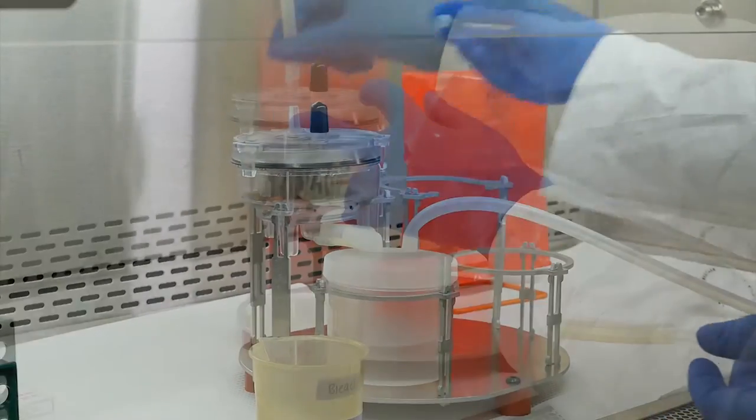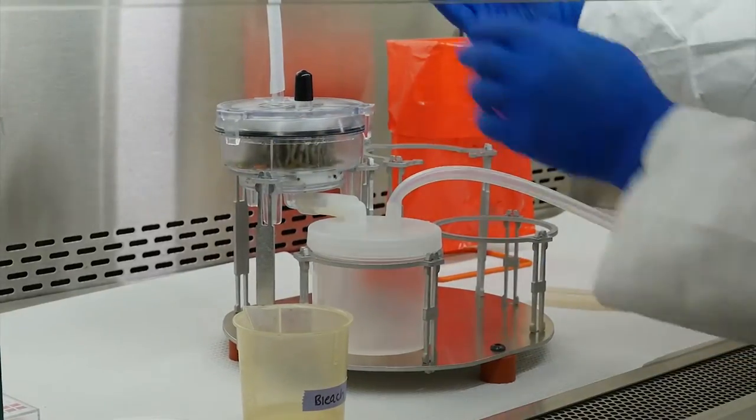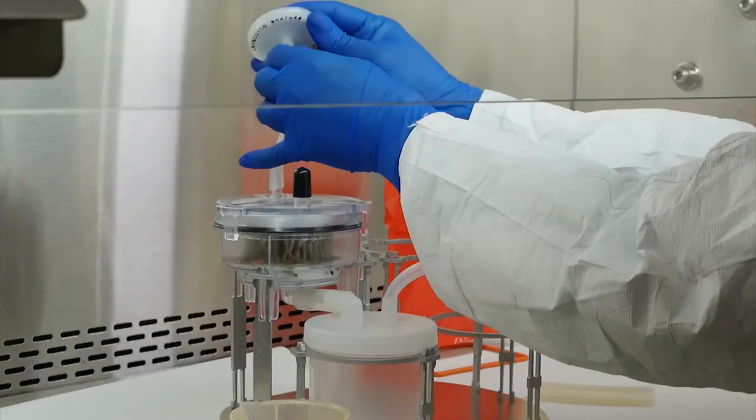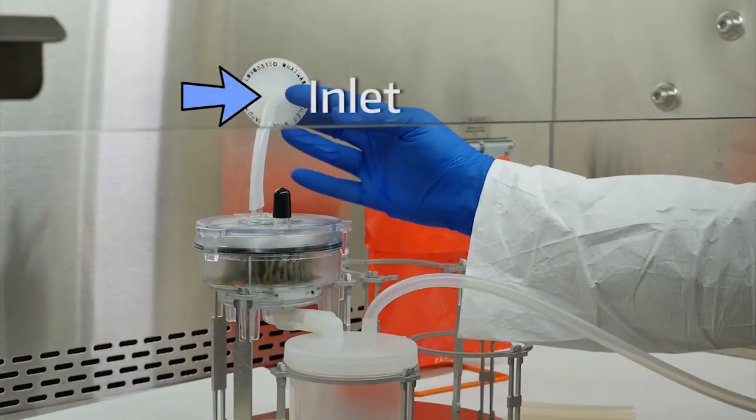Remove the white cap from the filter vent and attach the short, small diameter tubing and a VacuGuard filter. The VacuGuard inlet should face the ViroCap filter. This will help vent the filter when you inject the eluent and help prevent cross-contamination.